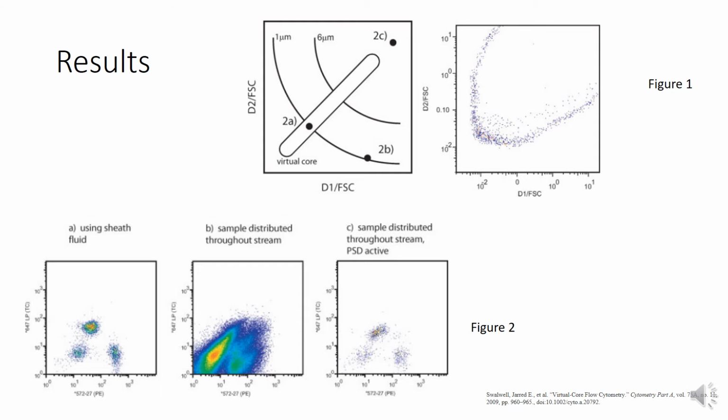However, there seems to be a loss in data for the gated measurements. Just visually, you can see that comparing C to A, there's way less data points in C. And according to the paper, there were only about 1.4% of the cells from B that were centered appropriately and therefore only able to be used. So while they can match the quantitative results, they lose out on the amount of data obtained compared to the traditional.